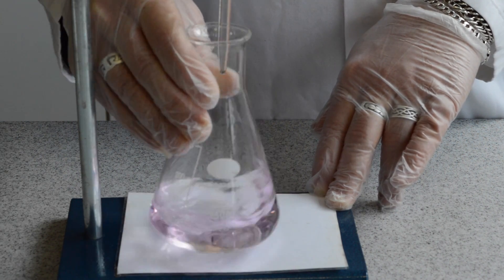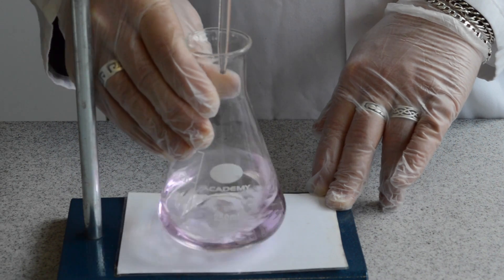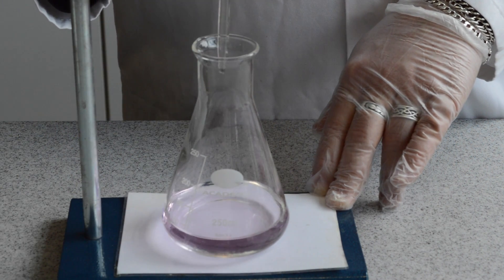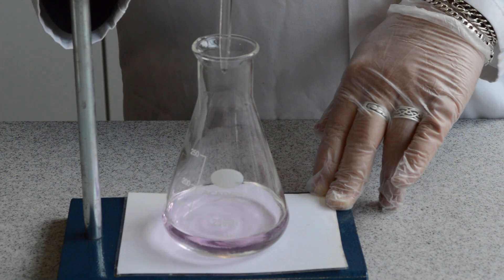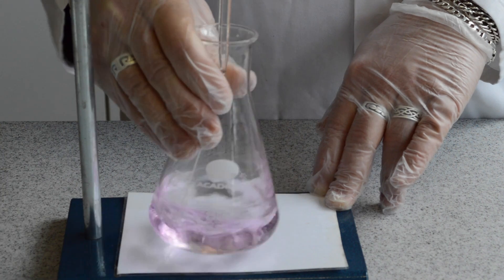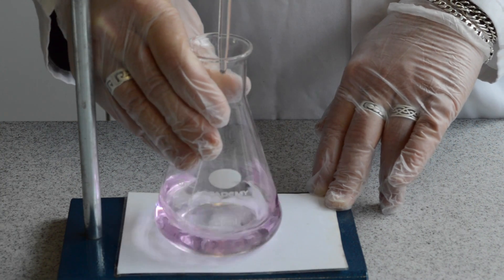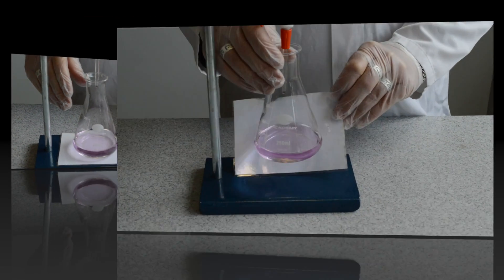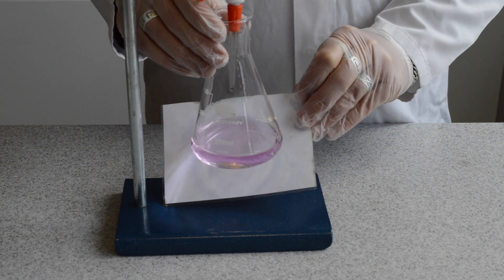The end point of the titration is reached when the colour change of the phenolphthalein indicator is permanent after swirling the contents of the flask. You will see this colour change easily against the white card or white tile on your burette stand base.